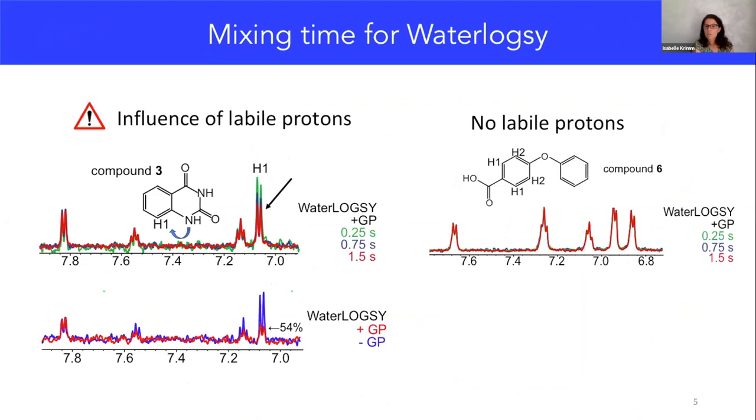I talked about STD, saturation transfer difference, and WaterLOGSY. So what about the artifacts that you can have, especially with very small compounds such as fragments? One of the artifacts is that you have to be very careful with the mixing time that you use for the WaterLOGSY. Because WaterLOGSY is just an NOE between water and your compound.